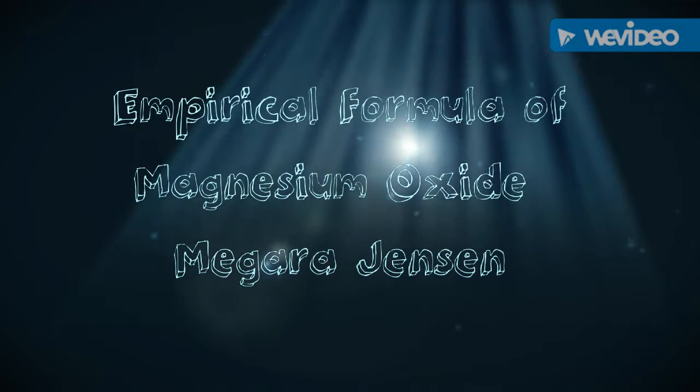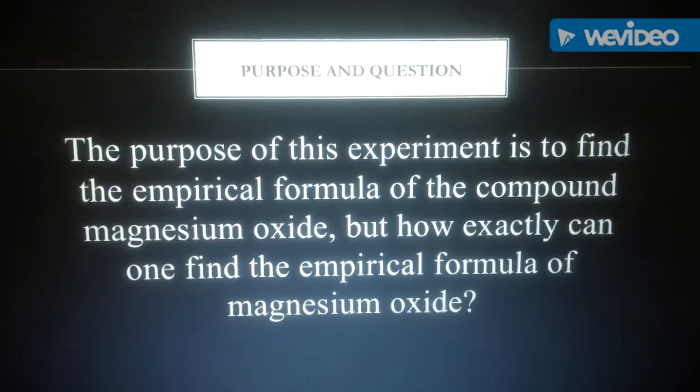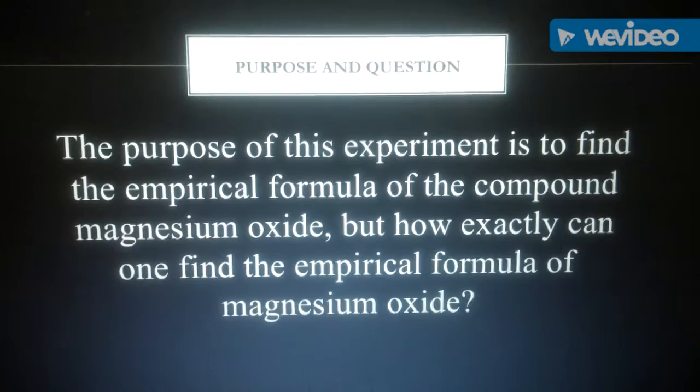My name is Megara Jensen. I go to the School Harmony Science Academy, and today I will be presenting the empirical formula of magnesium oxide.